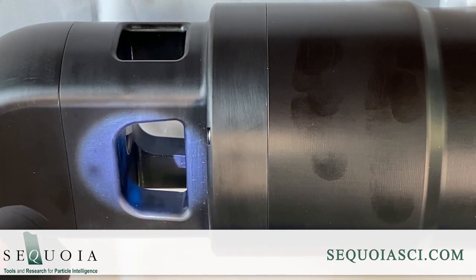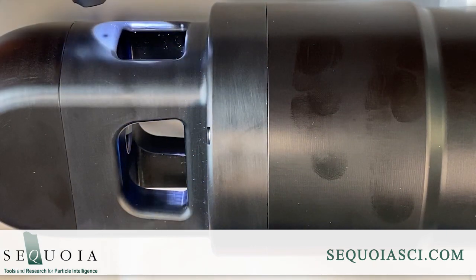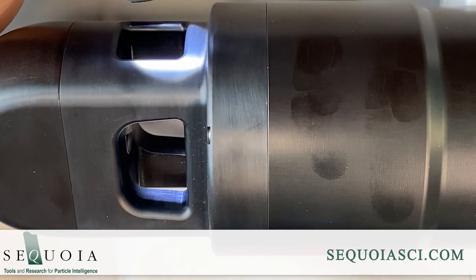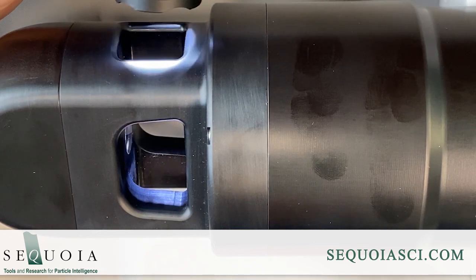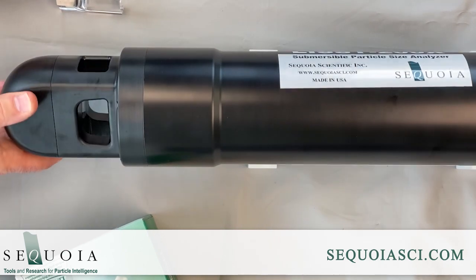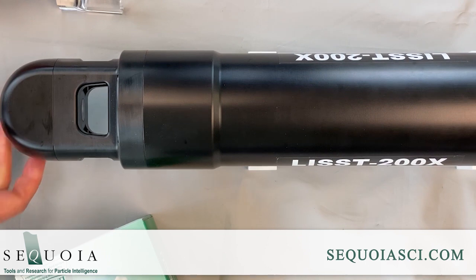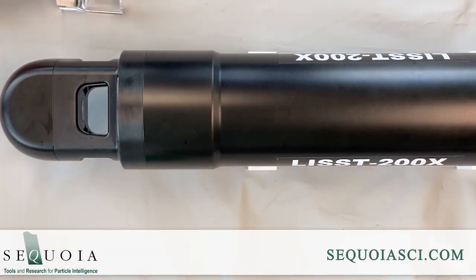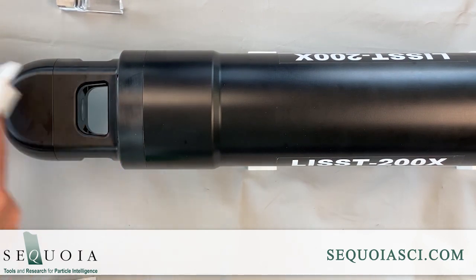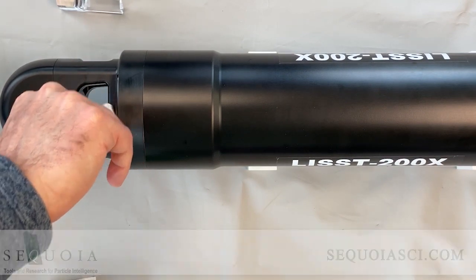By shining the light from one side and viewing from the other, the surface of the windows can be easily checked for cleanliness. If there is visible contamination on the windows, it is recommended that they be cleaned with a mild dish soap, lots of water, and a clean finger. If the windows appear clean, then a simple cleaning with a small amount of glass cleaner and a soft paper wipe may be all that is required. Be sure to clean both windows and to inspect them afterwards to make sure they are as clean as possible. Do not use strong solvents such as acetone or toluene, or abrasive cleaners that could scratch the glass.